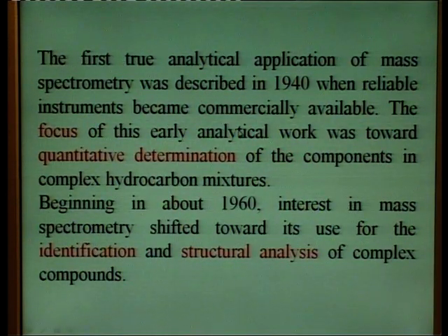The first true analytical application of mass spectrometry was described in 1940, when the focus was on quantitative determination, but in 1960 the focus started moving towards identification, that is the qualitative one, and the structural analysis of the various compounds.